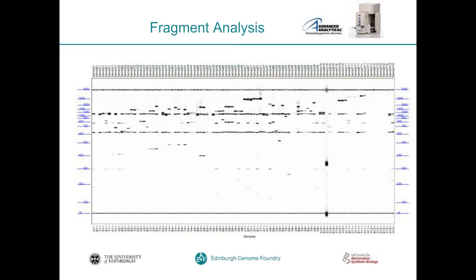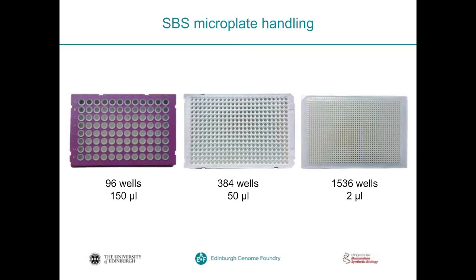So it is, compared to the QPix, which uses 96 pins, they are much slower, and it's great for me to be able to save so much time picking and plating using the QPix as opposed to a single pin picker. So as you can imagine, with any high throughput process, we handle everything in plates, not in tubes.